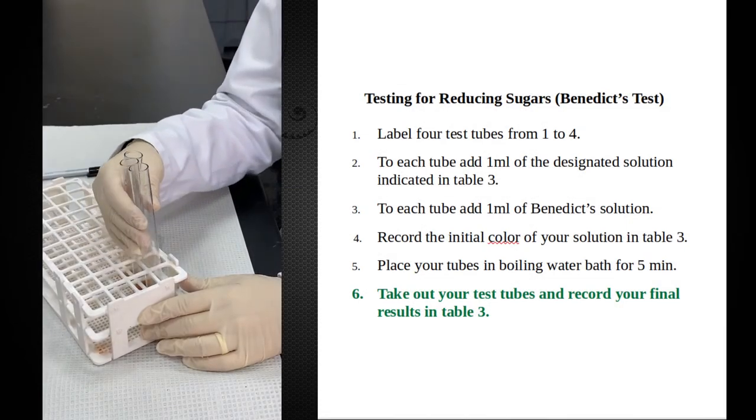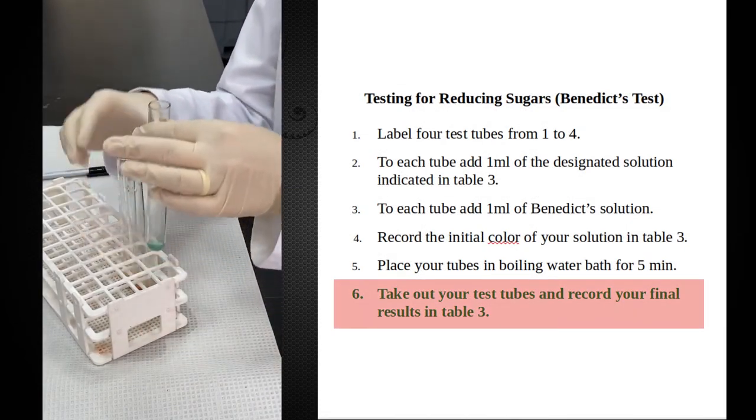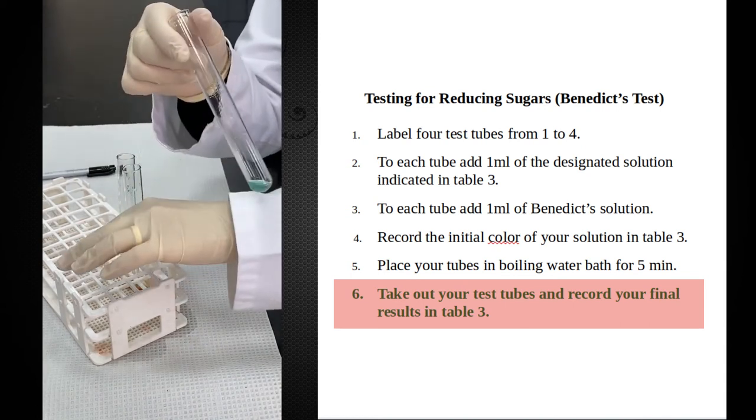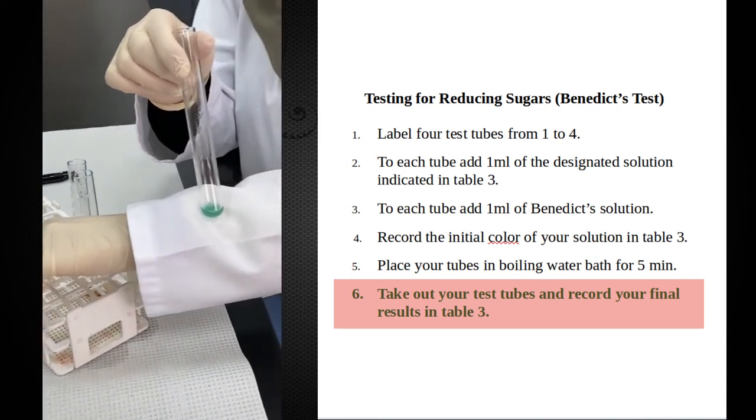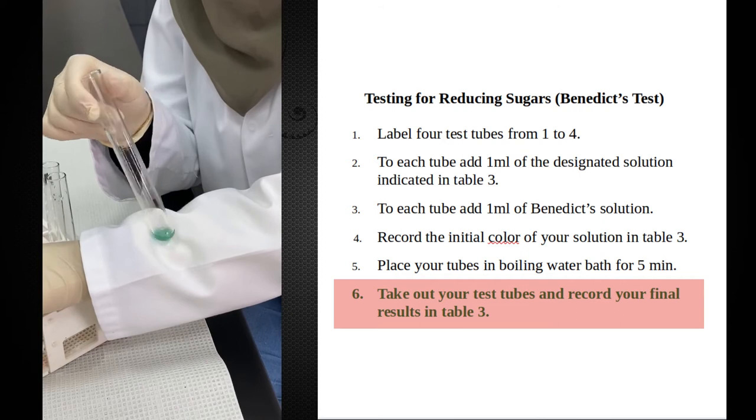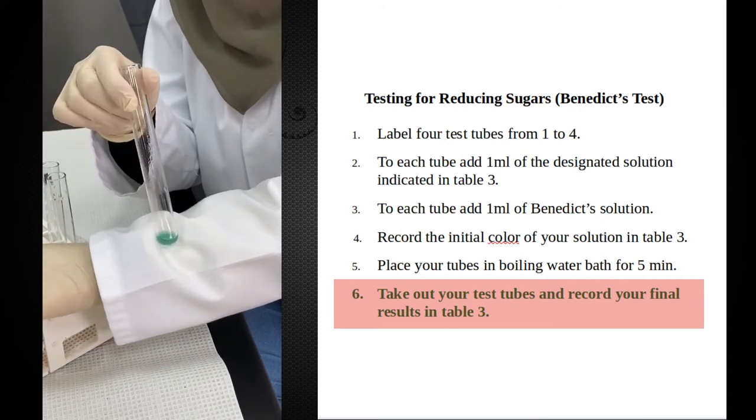After five minutes in the water bath, we can see the color change. This is Benedict's test. The negative control after five minutes in the water bath - the color is still blue, no change in color.